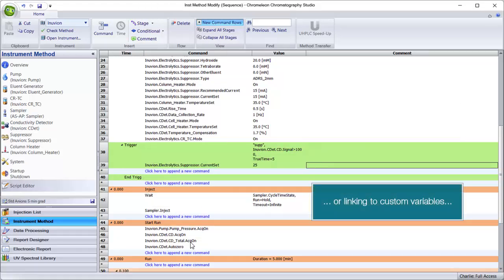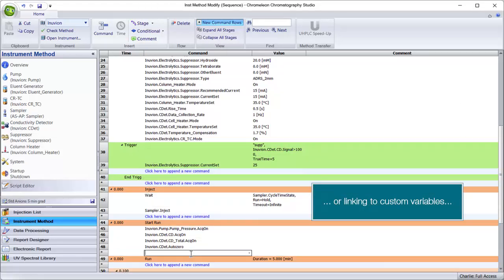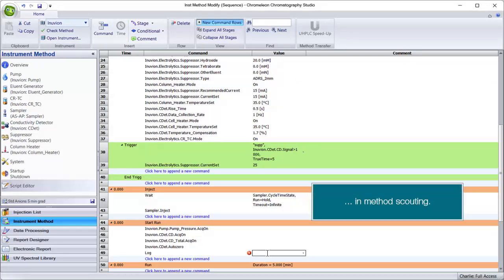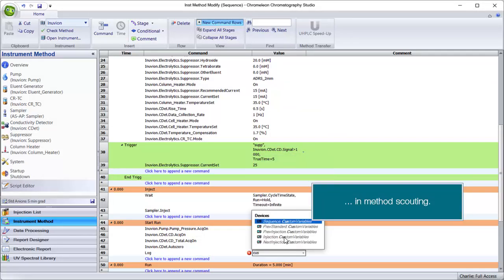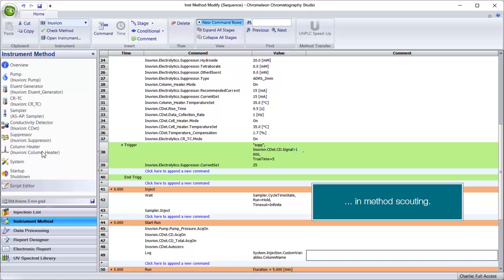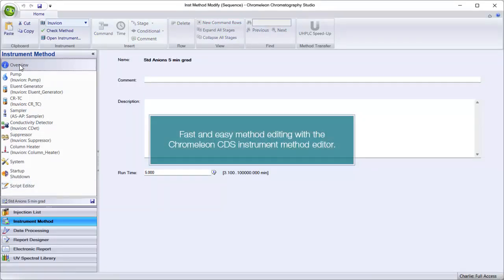You can also link to custom variables to log the column used in method scouting. Fast and easy method editing with the Chromelion CDS Instrument Method Editor.